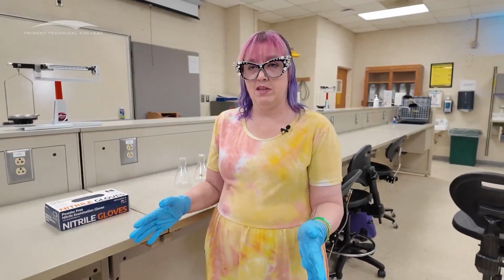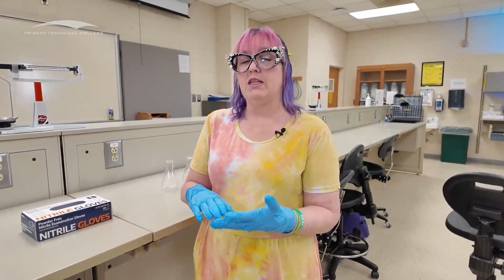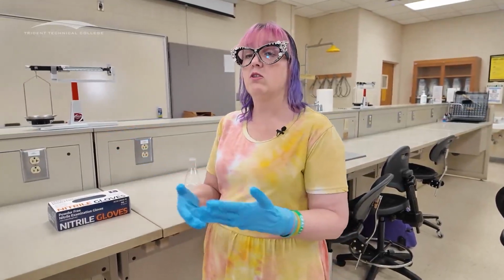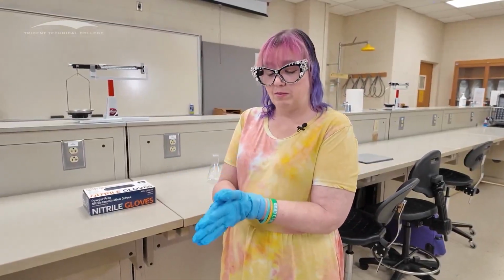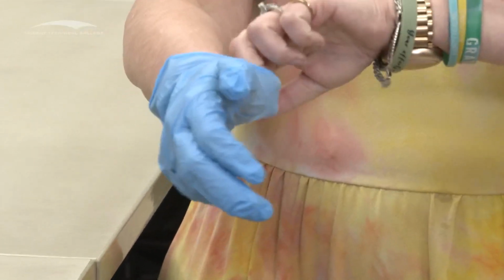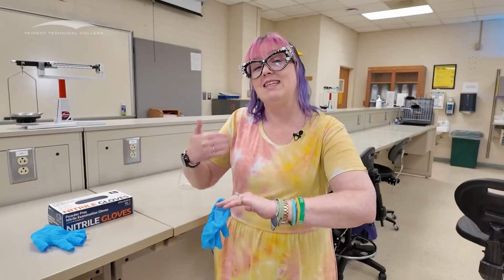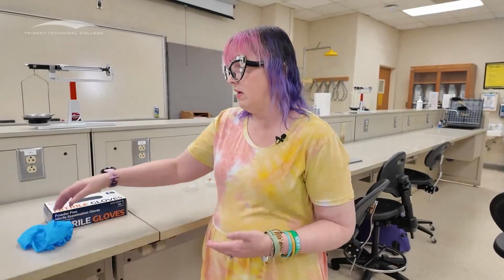When I'm in the lab and I'm working with these gloves, everything is fine. If I have to leave the lab for whatever reason, I need to go to the bathroom, I need to take a phone call, I need to eat something, I need to do something outside of the lab, including taking a drink, then I need to take these gloves off. I can take the first one off fairly easily, right? But when I go to take the second one off, I want to hook my fingers inside of it, grab a hold of the inside, and then pull it off like that so that I'm holding the inside, not the contaminated outside part of the glove. And then I take those off.